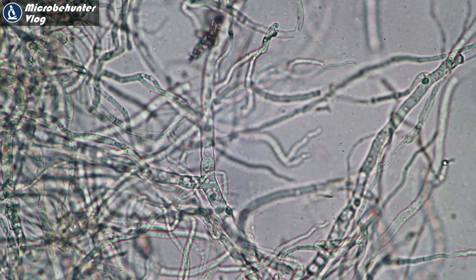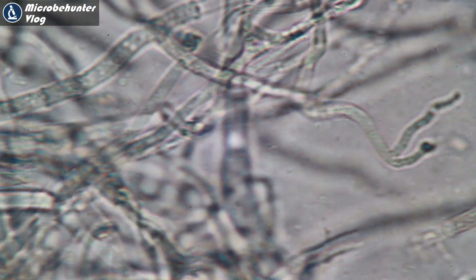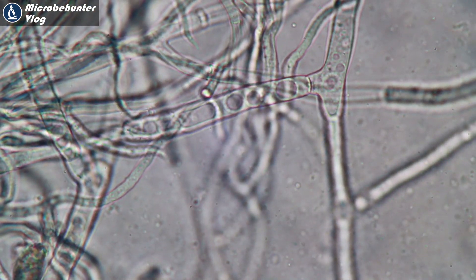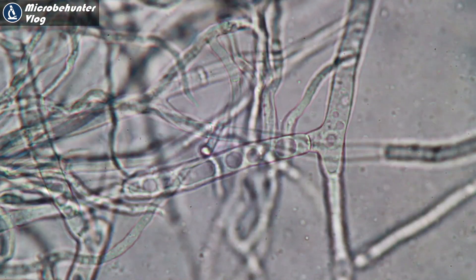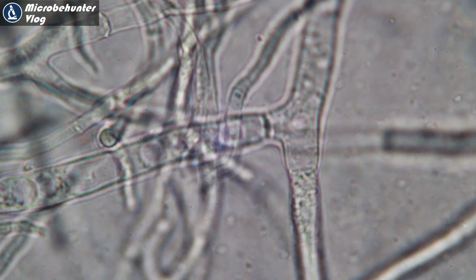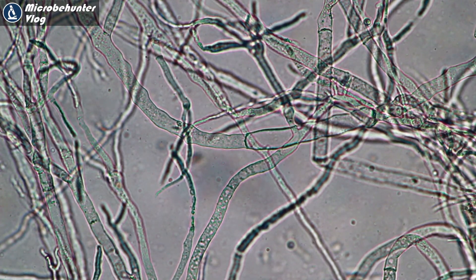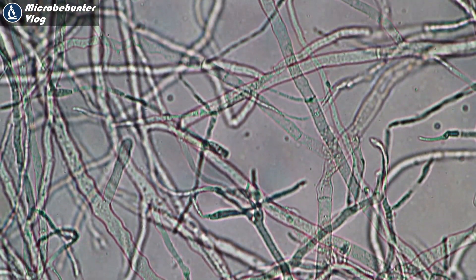What I have not seen are spores, which surprised me a little bit. I saw some other dots floating around in the liquid — could be bacteria, I'm not so sure. They could be moving because of Brownian motion as well, but I could not see any spores. I looked around and here we see again a branching right in the center. We also saw some cell organelles inside the individual cells. So ultimately I took a second sample from a different part of the carrot, and there I found some more spores — I'll show this to you later.